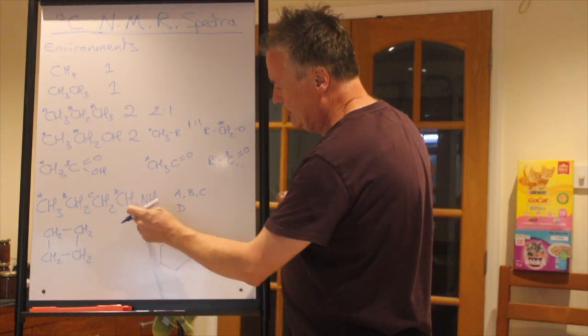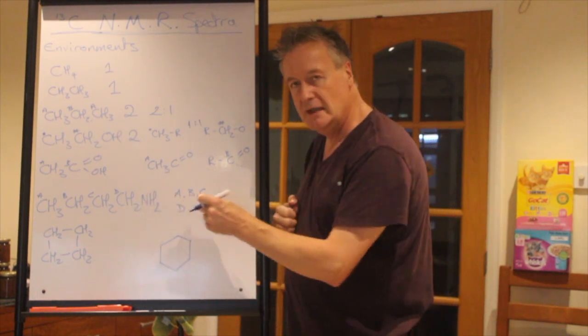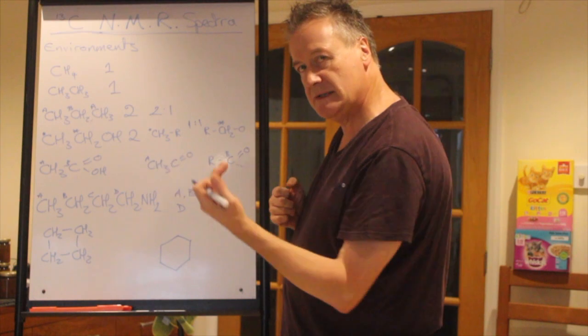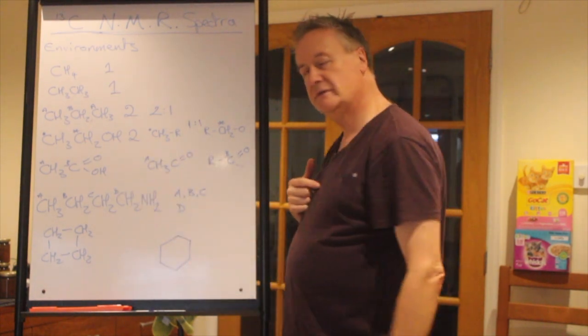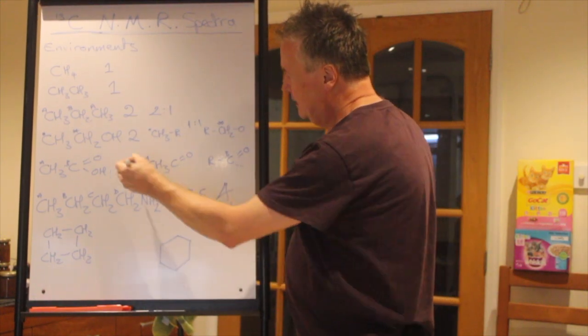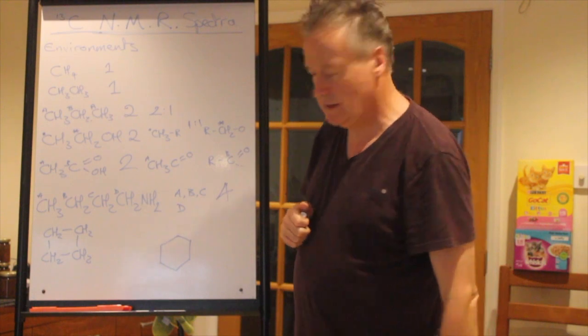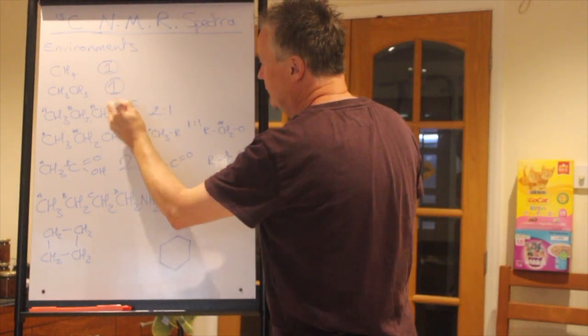And then that D, where it's attached directly to the NH2, will be distinctly separated, and in fact it'll be a lower energy one, further over to the left. So you will see 4 environments there. Let me put that, I said 2 earlier, but there we go. Right, so when you look at those, these are the numbers of the environments so far.